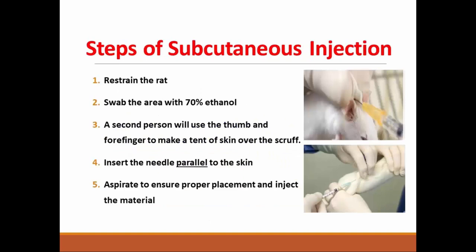Steps of subcutaneous injection. First, restrain the rat. Then swab the area with alcohol. A second person will use the thumb and forefinger to make a tent of skin over the scruff, which is either in the neck or the back. Insert the needle parallel to the skin — there is no angle here. Aspirate to ensure proper placement, then inject the material.